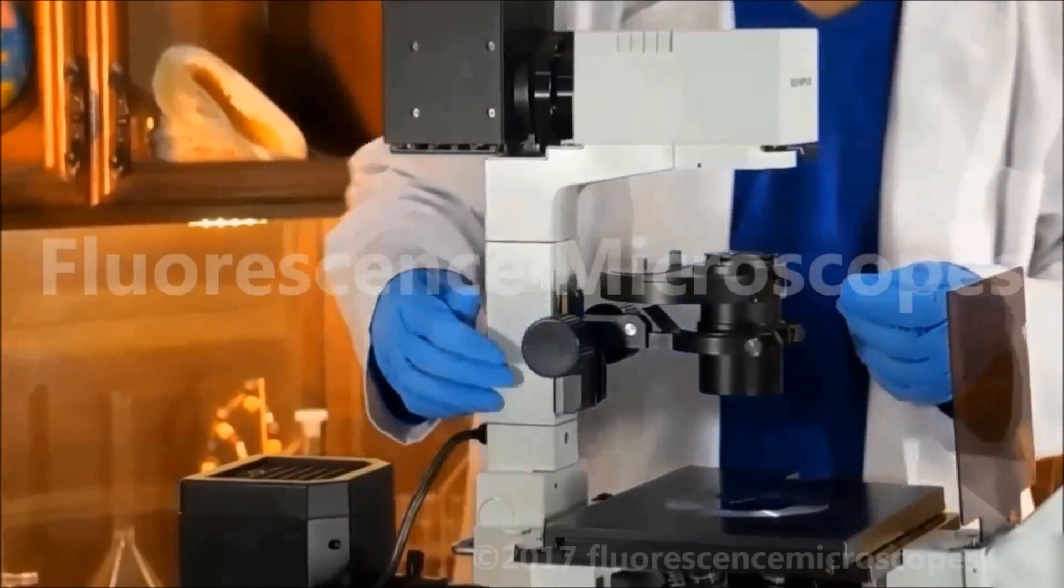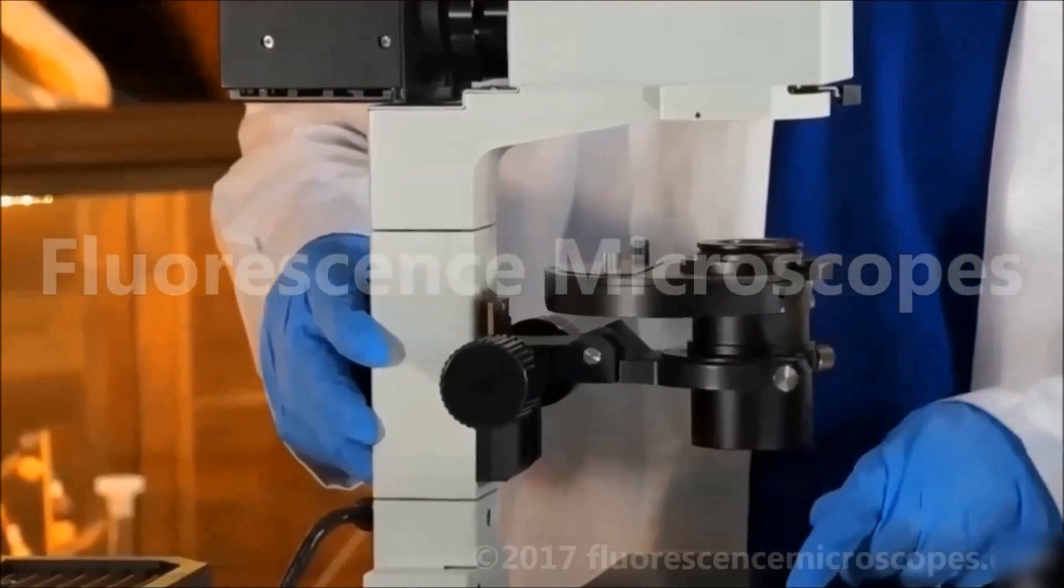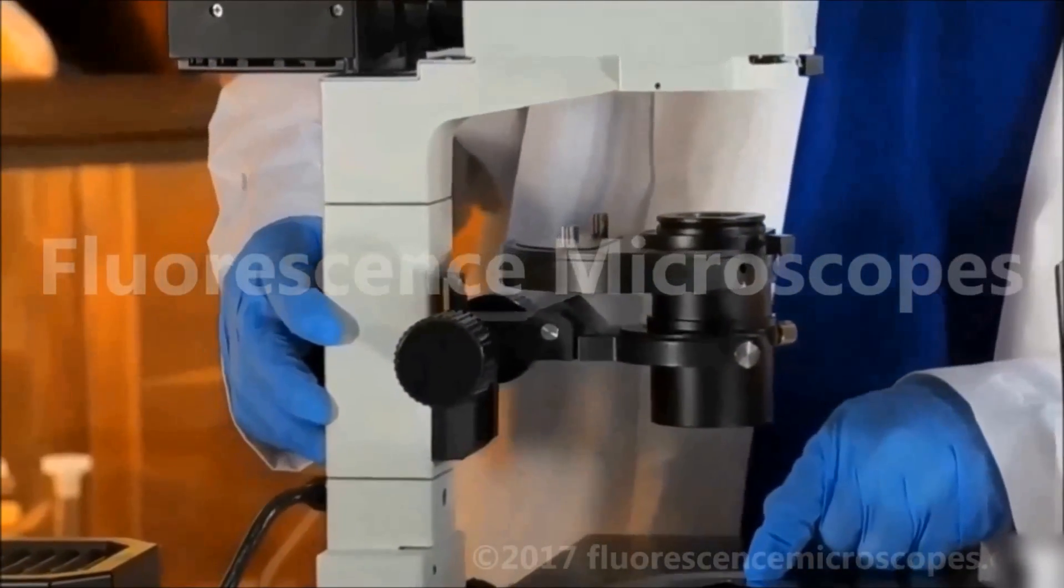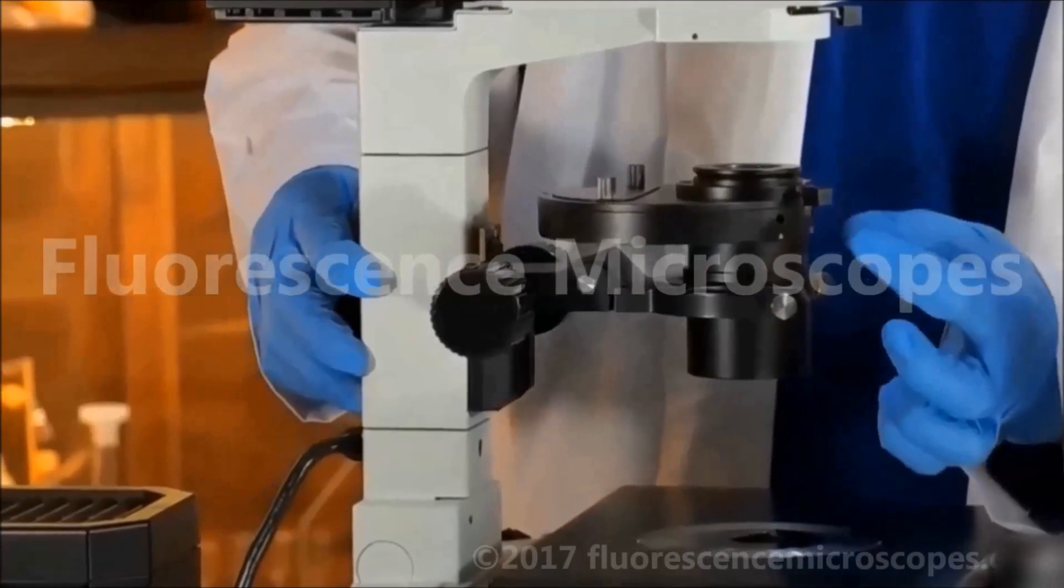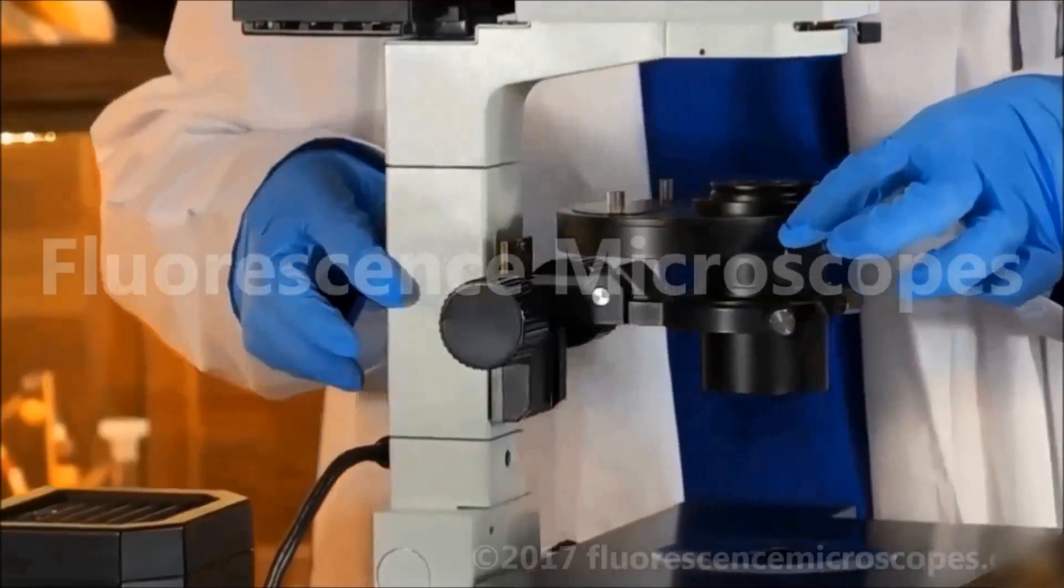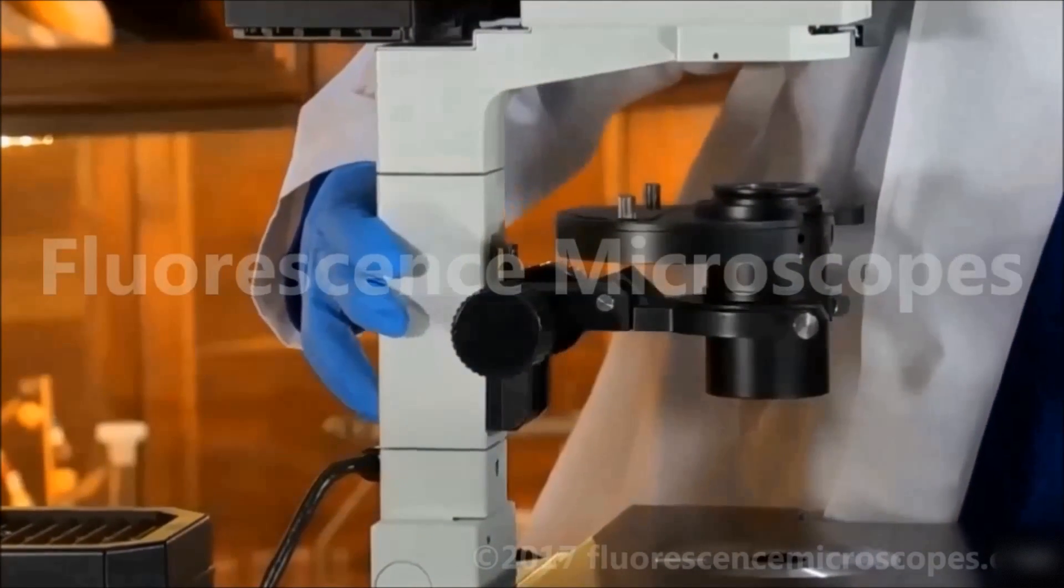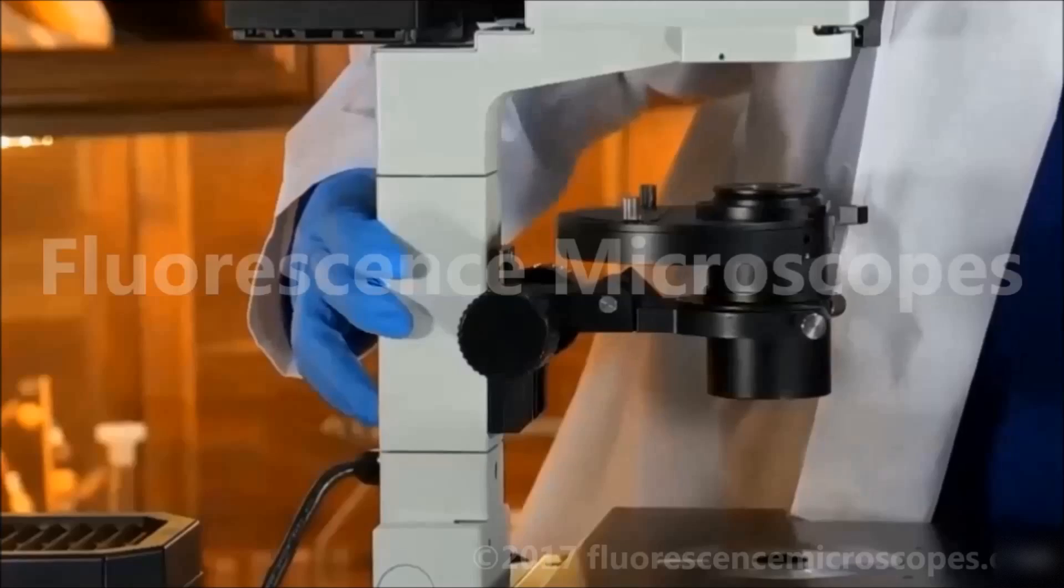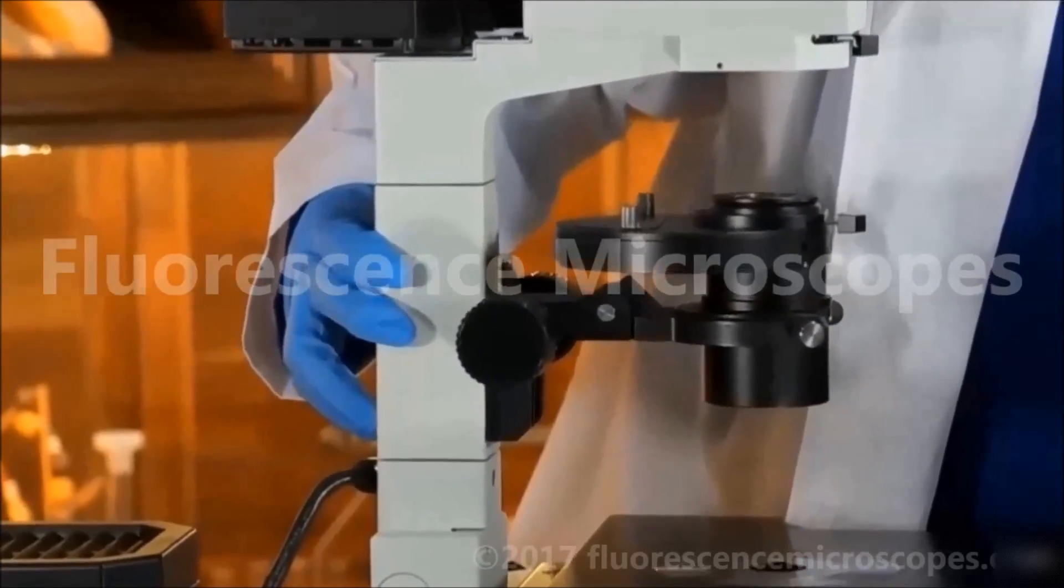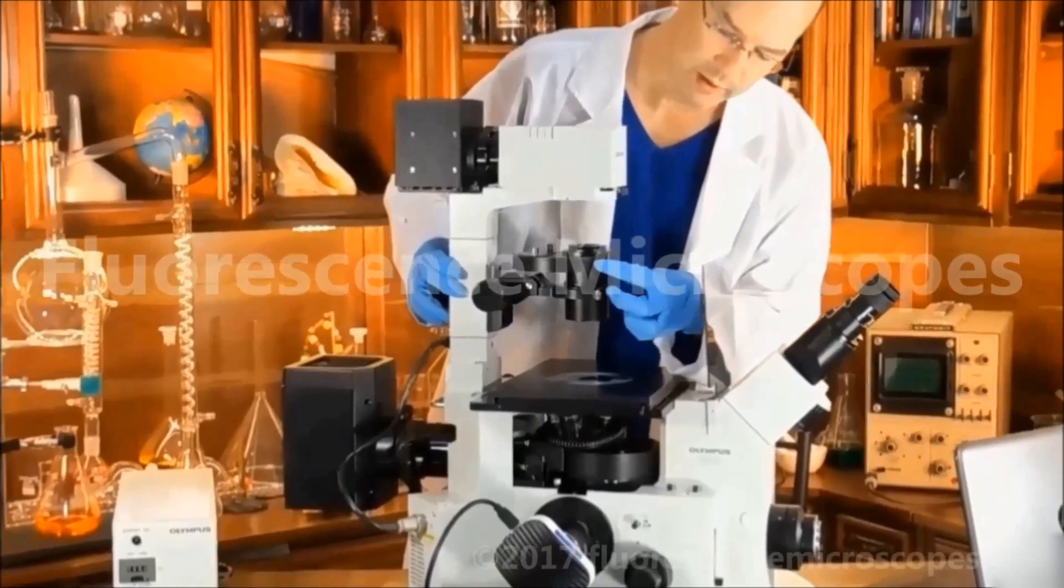To center the phase annulus inside the condenser with the phase ring inside the objective, the back aperture plane, you would use these two screw openings. And you would use these two screws. These little 1.5 millimeter hex screws. You can screw them in these openings.